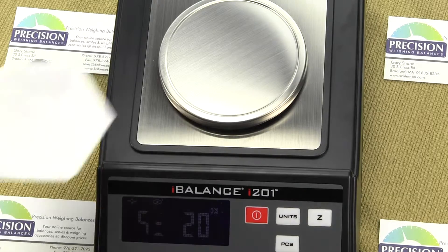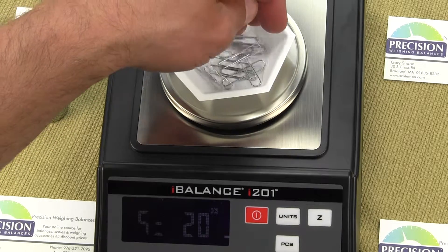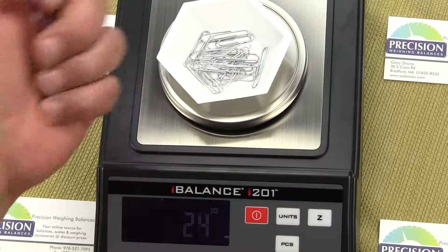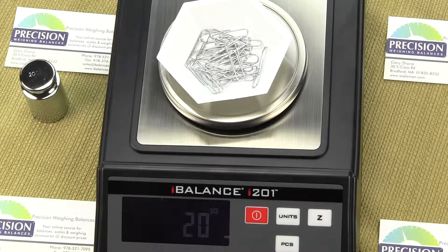We'll put on a container — we're using standard paper clips bought at Staples. First, place the container on the platform and press Z to zero out its weight. I've pre-counted 20 paper clips and I place them on the weighing platform. Once I have a stable reading — shown by the stability icon — I press the units key, it says 'pass,' and now it shows 20. If I take off a paper clip, it shows 19. Another one off — 18, then 17. Add one back — it increments up. There's our 20.